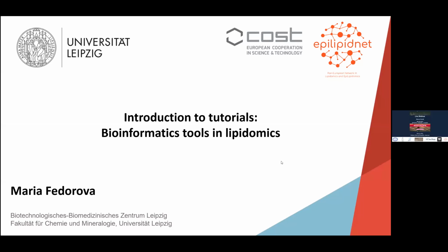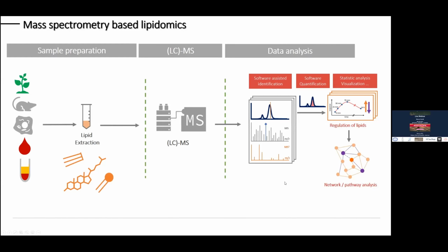Tutorials. So, tutorials on the bioinformatic tools in lipidomics. Over the last 3 days, we learned with you already a lot about how we should handle our preparation of the samples for successful and accurate lipid extraction, how we can do all those different combinations of chromatography with mass spectrometry, or shotgun mass spectrometry for lipidomics.